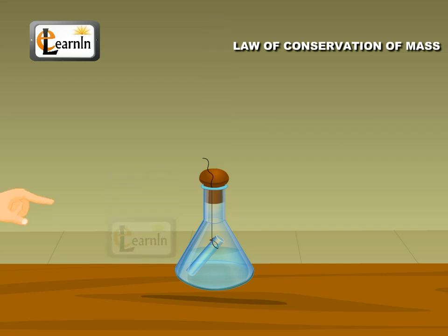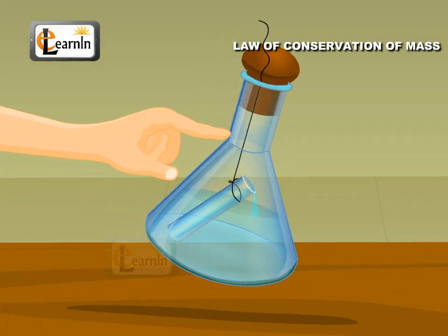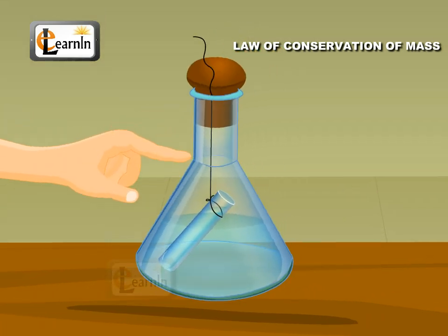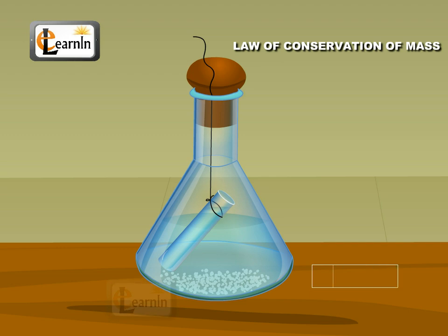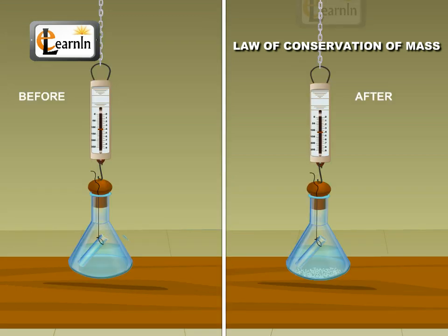The conical flask is tilted so that the two solutions are mixed. A white precipitate of barium sulfate will be formed, showing that the reaction has occurred. Now weigh the complete apparatus all over again. There will be no change in the weight before and after the reaction.